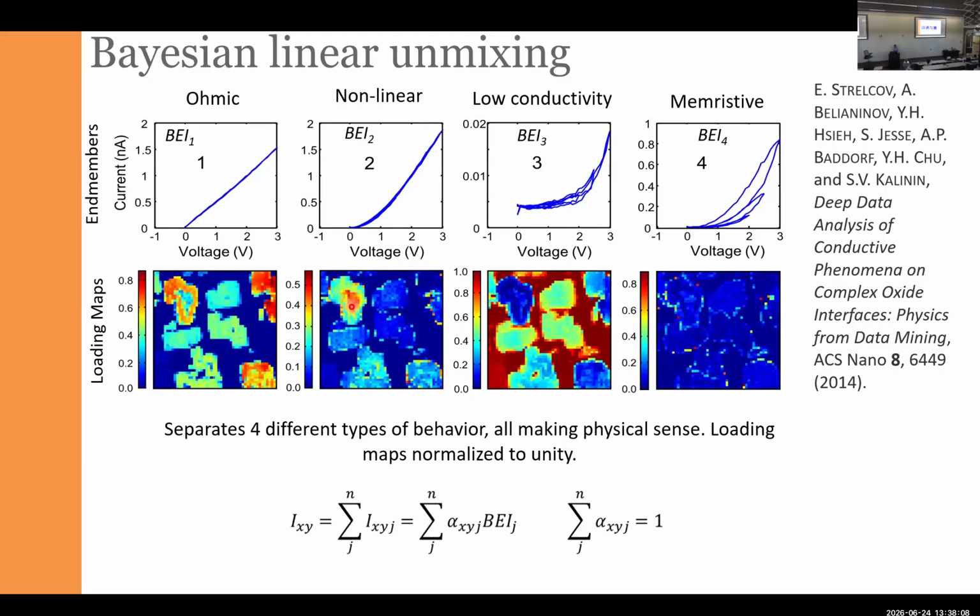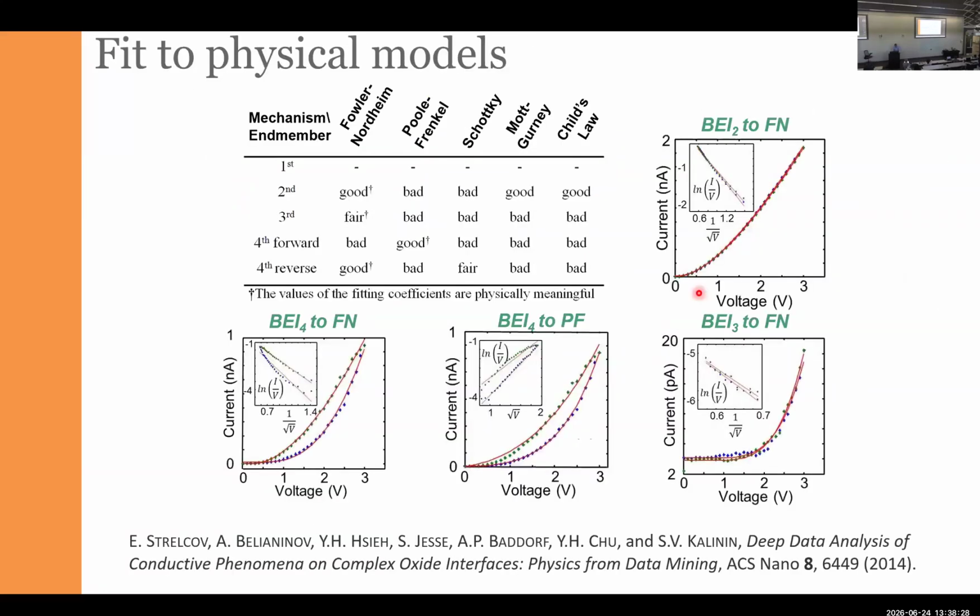And you can see that the central part of this grain is more nonlinear than the periphery. You can also see that the hysteretic component is sitting only at the boundaries between the 2 phases. So this is pretty much a textbook example of the linear methods giving non-trivial results when applied to complex multidimensional data, where there is not much we can do by the normal approaches.